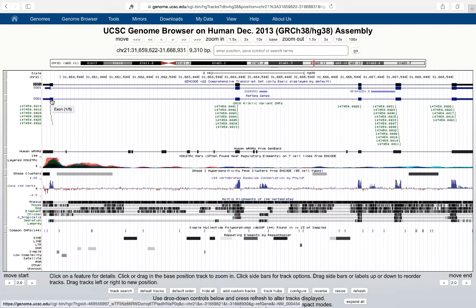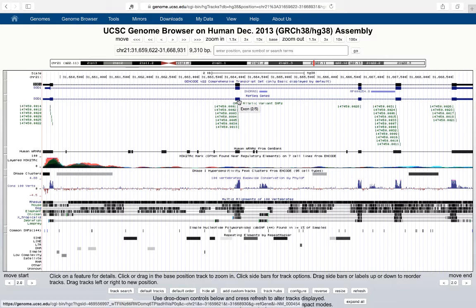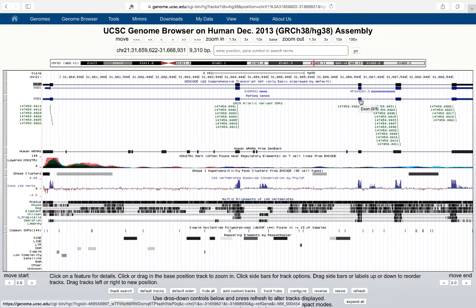This is exon 1 of 5. If I move to the right, it'll tell me that this is intron 1 of 4. This is exon 2 of 5, intron 2 of 4, exon 3 of 5, exon 4 of 5. You can see that there are five exons.